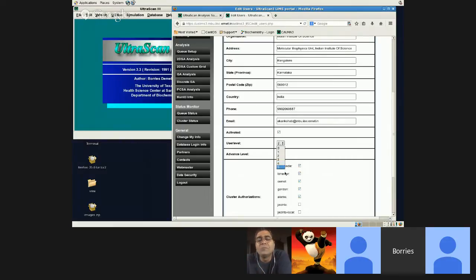And level 5 is somebody that also has access to running SQL commands directly on the database, to fix database corruptions. Like, for example, my programmer, he can go in there and investigate if there's ever an issue with the database and fix it from the website.